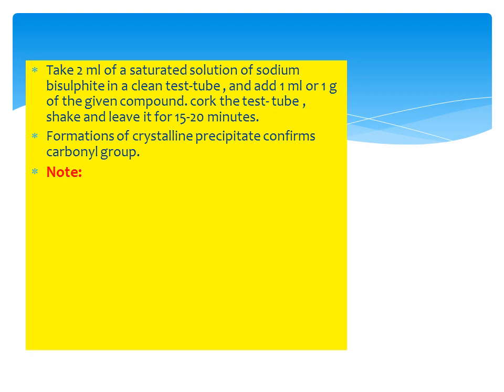It means that both smaller aldehydes and smaller ketones are very responsive towards this test. So it is not recommended to use this test in order to distinguish them, because if dimethyl ketone is there and formaldehyde is there, then the test is positive in both cases. Aqueous solutions of formaldehyde and acetaldehyde form addition products, but they are highly soluble and precipitates are rarely formed. Thirdly, acetophenone and benzophenone do not give this test. So this is not recommended either, because we are not after confirmation.